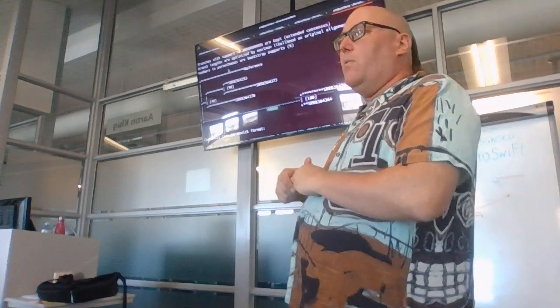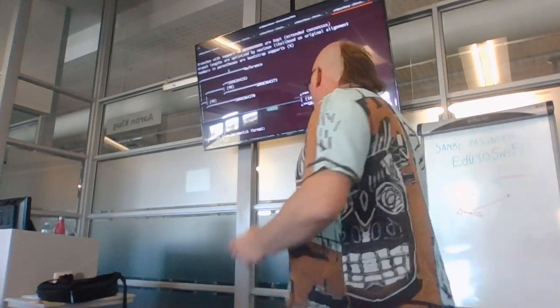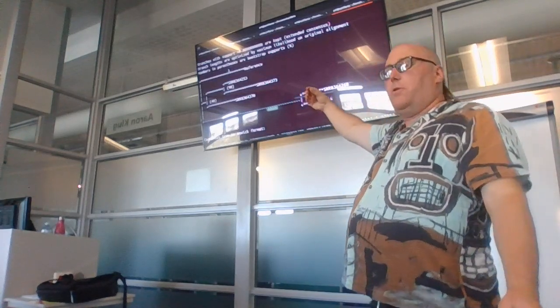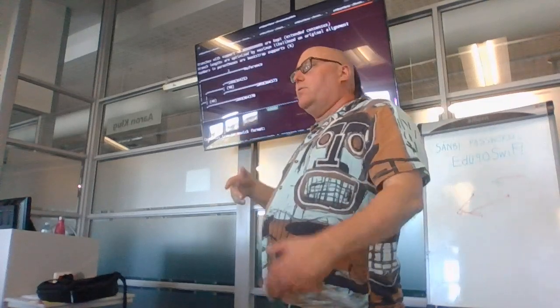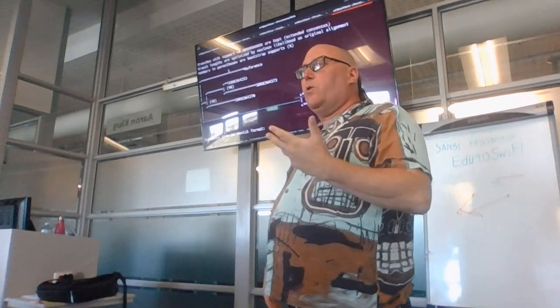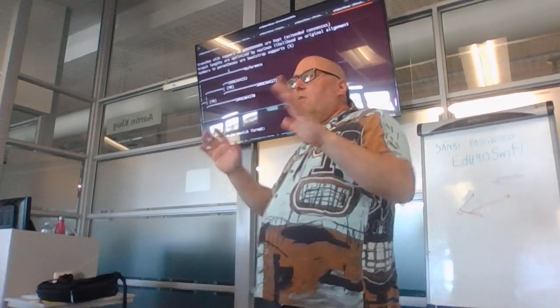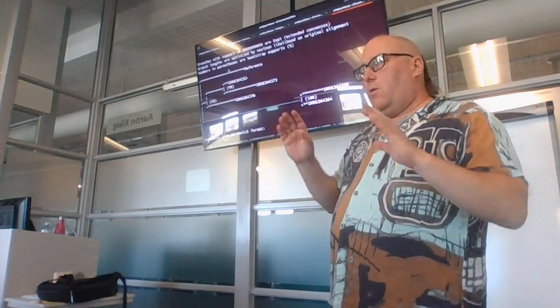So one time I was reanalyzing the Mycobacterium tuberculosis data from Indonesia. I built the phylogeny and I had these massively long branches, just 2 or 3 of them, and I couldn't understand it. I went back to the data, and typically one Mycobacterium tuberculosis sample compared to the H37Rv reference has about 2,000, 3,000, 4,000 single nucleotide variants, depending on which lineage you're dealing with.